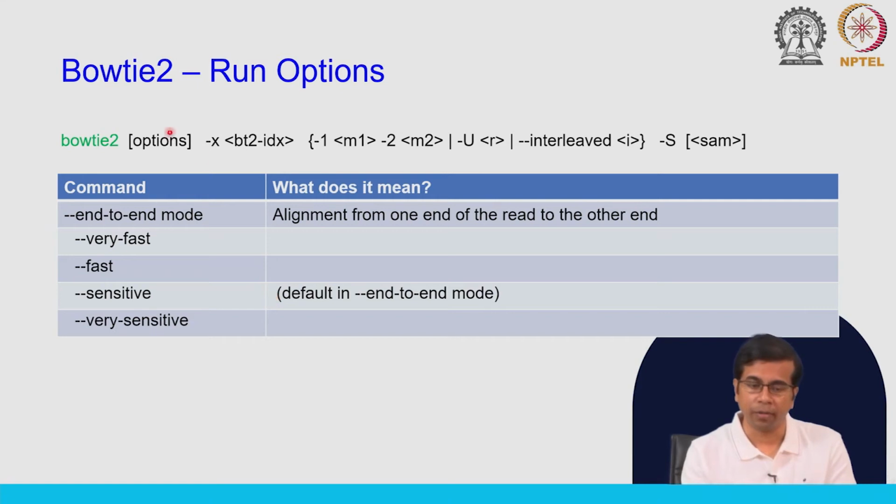So, what you are saying here is that we can sacrifice certain accuracy. We do not really need the absolutely exact or best match. We can sacrifice certain accuracy, but we want speed. So, you are sacrificing accuracy for speed. You then have these different levels, where you have a balance between speed and accuracy. If you come down to --fast, it means you want slightly more accuracy, and you can sacrifice some speed.